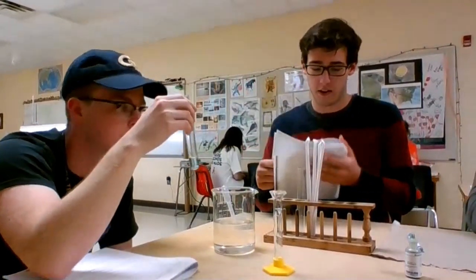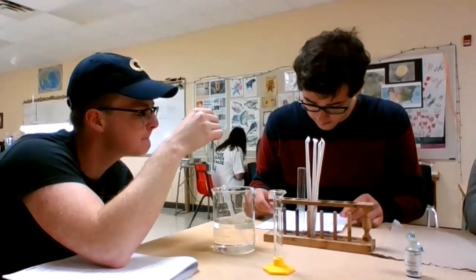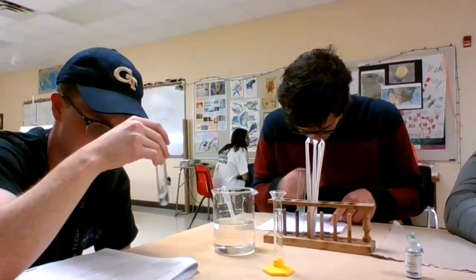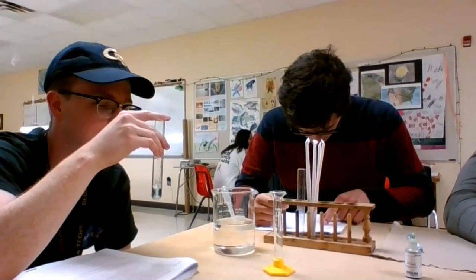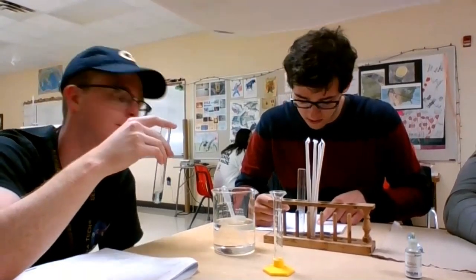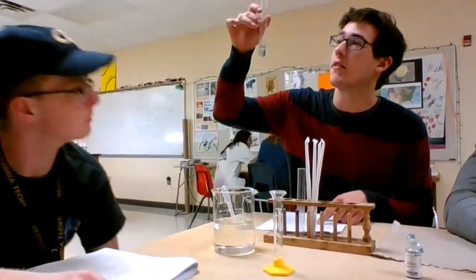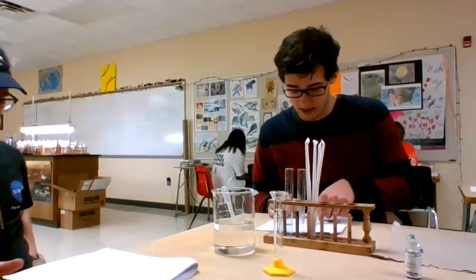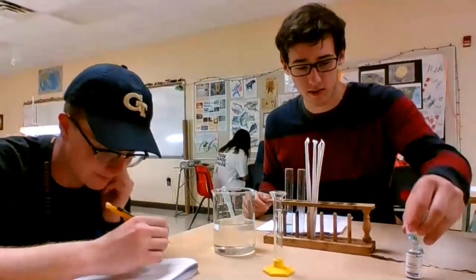Oh, okay. You said station 2 earlier. So I got rid of this. No, you're good. That looks fairly blue to me. Stir it up some more. They already have their blue. Determine if the pH of the water is acidic. Blue is blue at or above pH 7.6. This is safely blue, pH 7.6. That's for sure blue, it's just a light blue. And that's just regular water, right? So it's above 7.6 pH. Yes, at or above. So we're good on that.